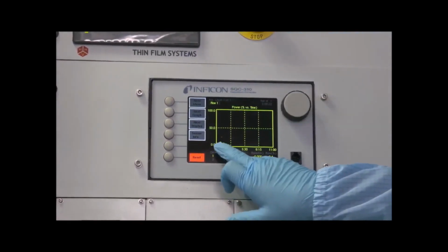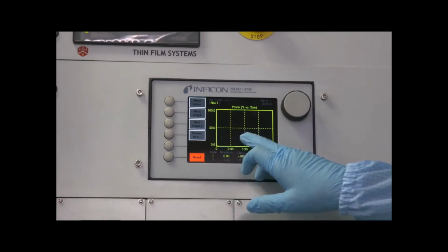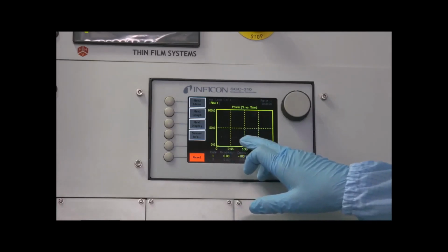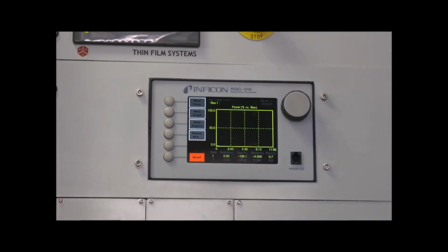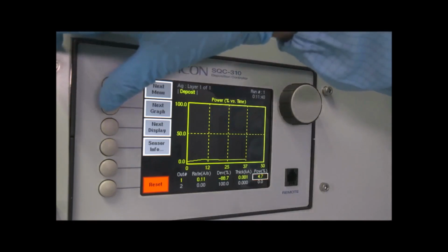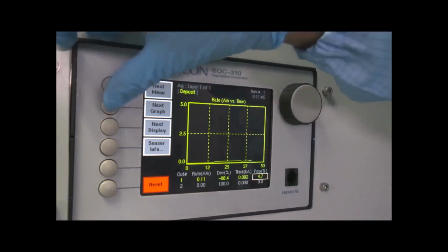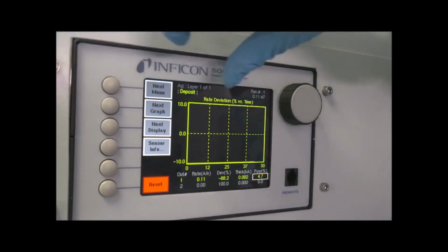It will start increasing from 0 to 1% as we said in the thin film menu, and it will soak for a certain time. After that it will move to the ramp to power. Right now after the soaking time, it starts deposition, and right now the power is 4.7 and the deposition rate is 0.11 angstrom per second. We can see the rate of deposition graph using the next graph button. This is the rate of deposition, and this is the rate deviation versus time.